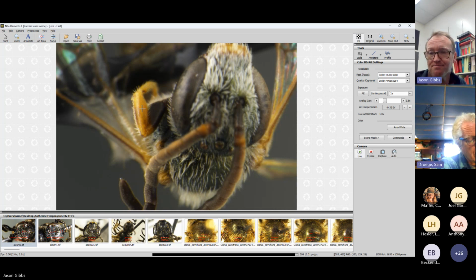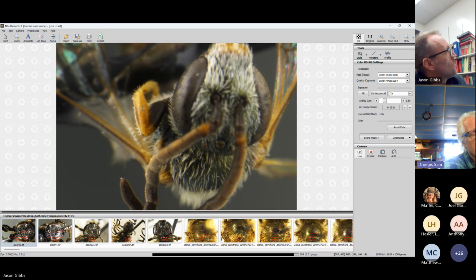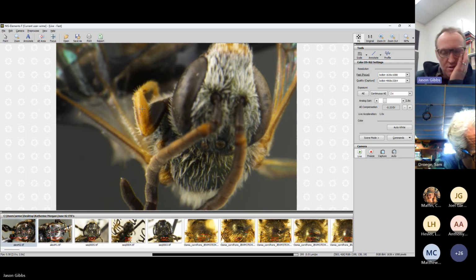I have to say that I almost entirely avoid trying to key out males. But do the clypeal pits, are they also defining that group in the males? Clypeal pits. The pit pattern on T2. No, sorry. Oh, the T2 pitting. I'm doing two things at once.